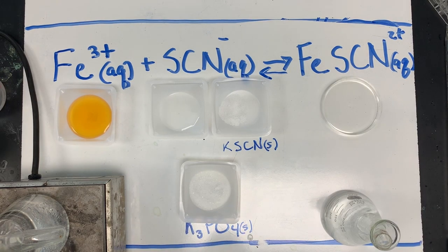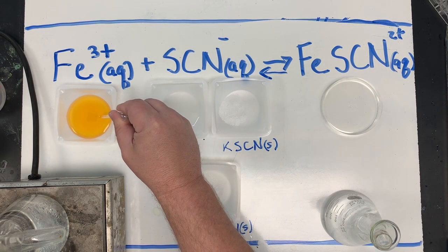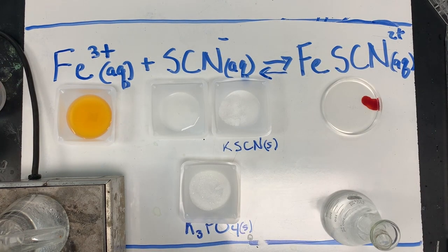Let's go ahead and let's put some more iron 3 plus in. We're going to put it right here. What's happening now? What's going on with our experiment?